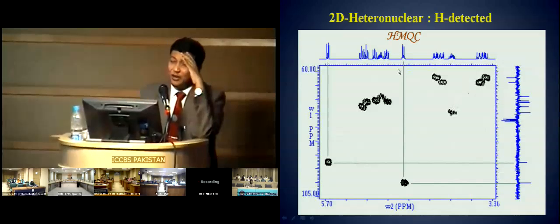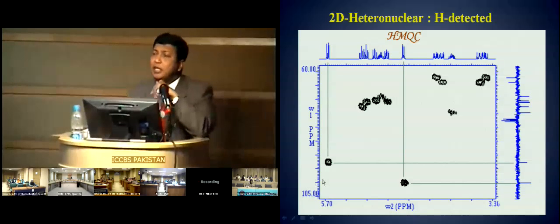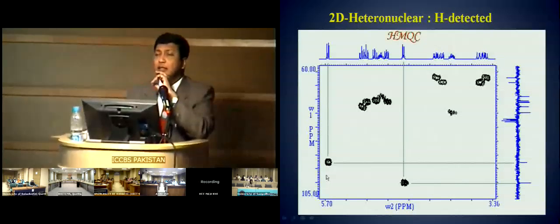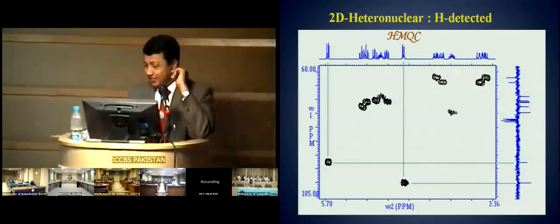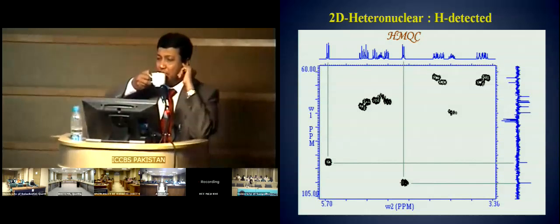So you spread all of these proton signals on the scale of carbon-13, right? And number 3, you have the capacity of identifying geminal pairs of protons, which you cannot do by any other technique in the world. Repeat it again. Okay. Technique, inverse NMR spectroscopy.